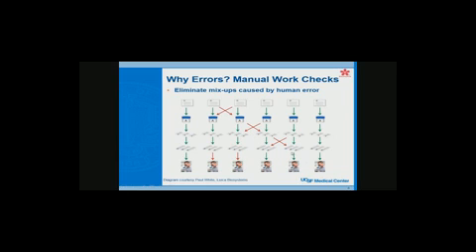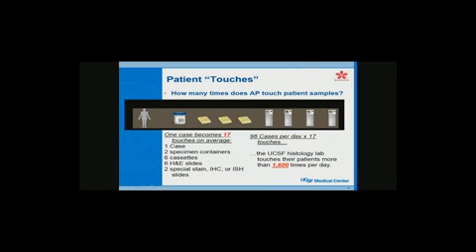But a lot of this has to do with slide labeling or misidentification of specimens, which is what we want to prevent. So where the mix-ups happen, they can happen at almost any stage in the process. We get a requisition. They could be mixed up between samples. The samples could be mixed up or the blocks could be mixed up between samples. Slides could be mixed up between blocks all the way down the line. So every single part of the process has to be looked at.